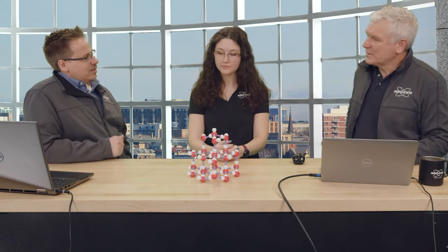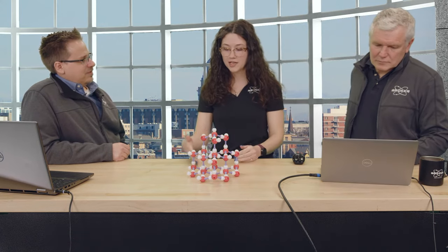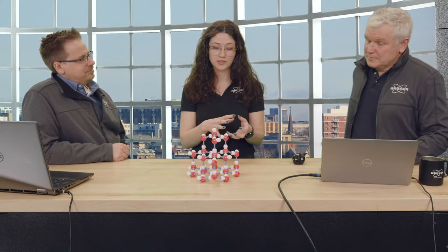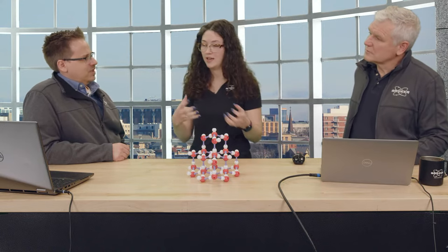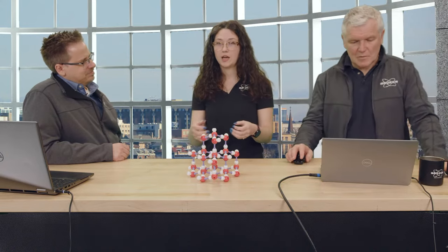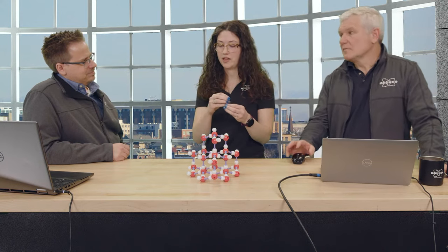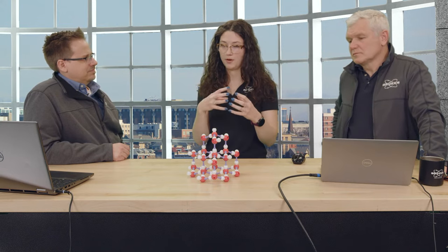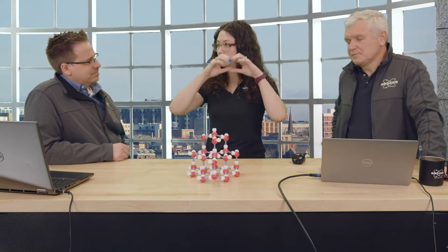So from Peter, what radiation do you recommend for this? We touched on that a little bit. Yeah, the first thing I would say is that it depends on the materials that you're working with. If you're working on really light atoms versus working with heavy intermetallics, f elements, then I would say focus more on what your chemistry, your materials need. But if you have those satellite reflections that are really close and you need to separate them, then I would go with copper, because then you've got a little bit more of a spread of those reflections in your images. So in this case, I collected this with moly and with copper, and there's basically no difference.